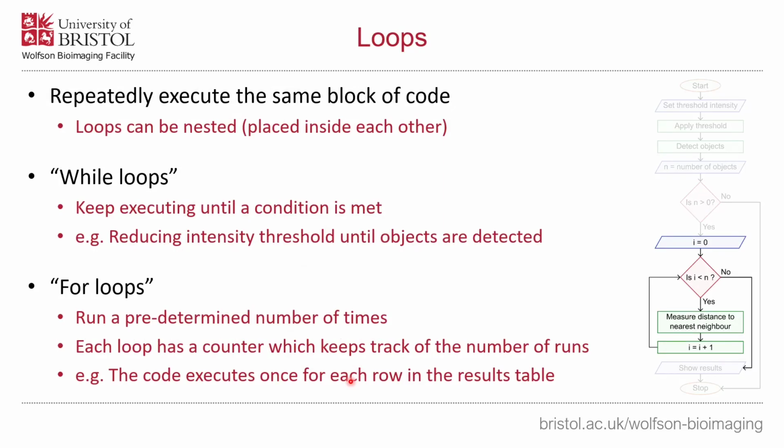Kind of extension of conditional statements are loops. There's a couple of different flavors of loop. You've got while loops and for loops, and we're going to go through both of them over the next few slides, but we're going to start with while loops.